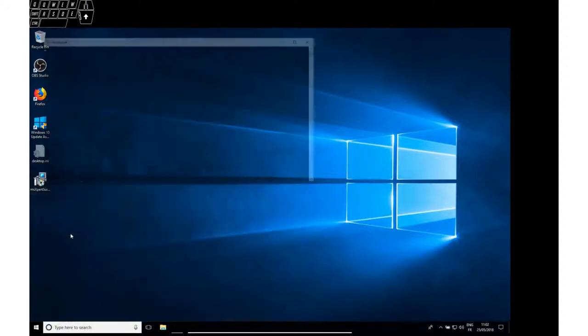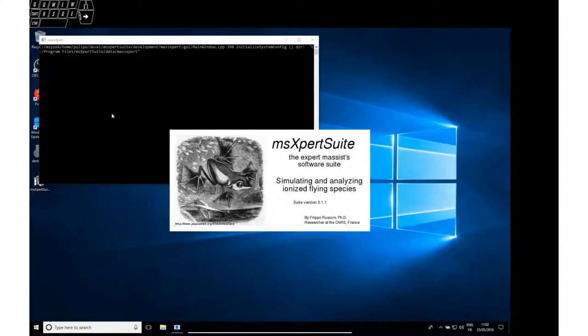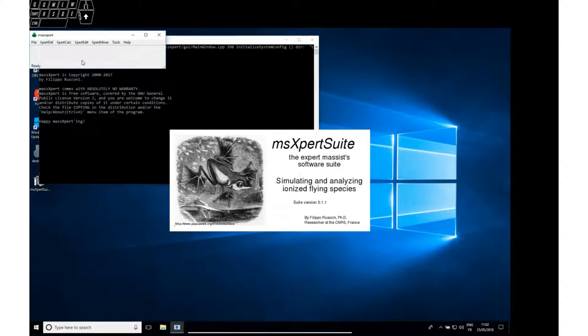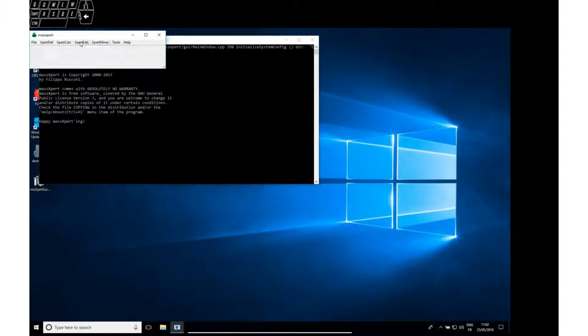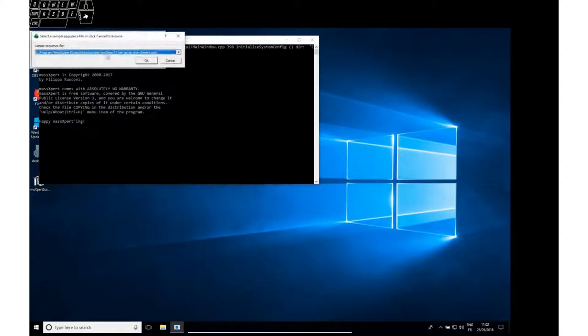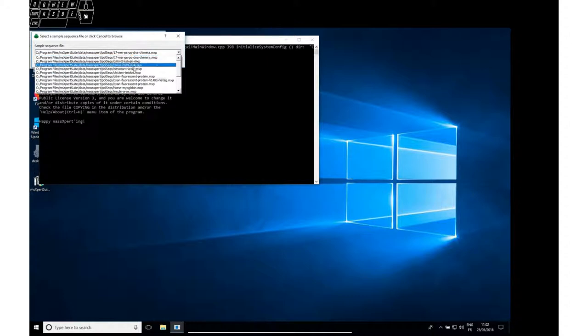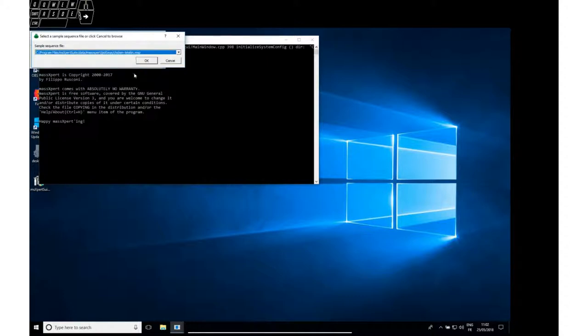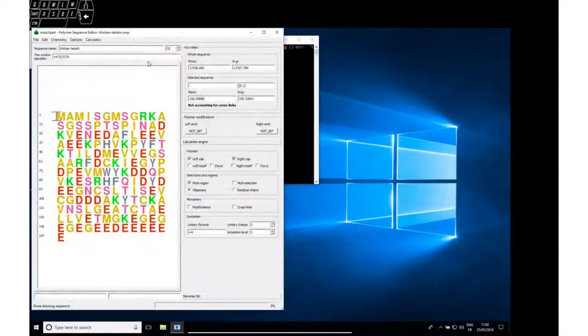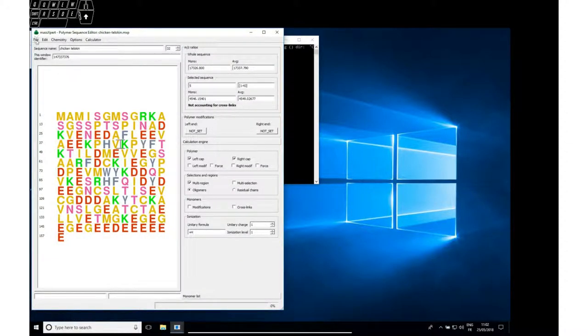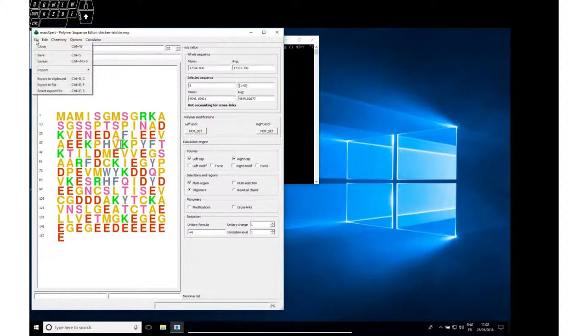Let's start Mass Expert just to check that it actually works. Open a protein sequence. Fine. It seems to work.